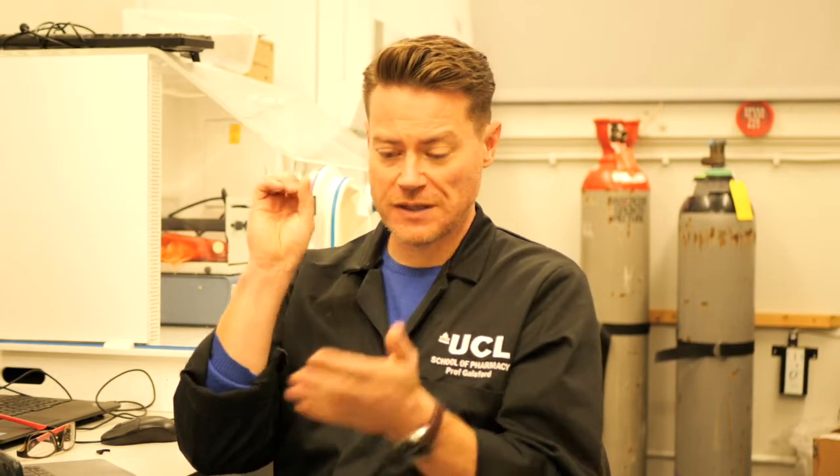It's inert, and so it's sprayed onto the surface of the sample with a special technique called a sputter coater. I love that word, sputter, not splutter, sputter coater. Okay, so that's essentially heating up some gold to atomize it, and then those atoms of gold travel across and they land on the surface of your sample, and they build up a really, really thin layer across the surface of your sample. It's really important that the layer is thin.